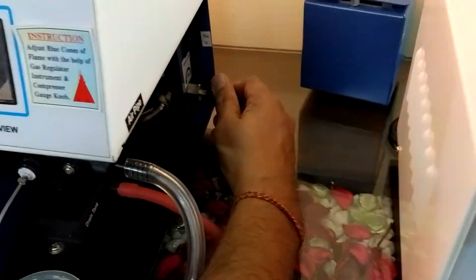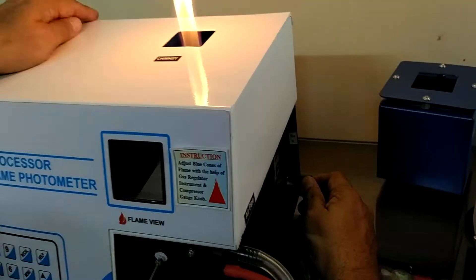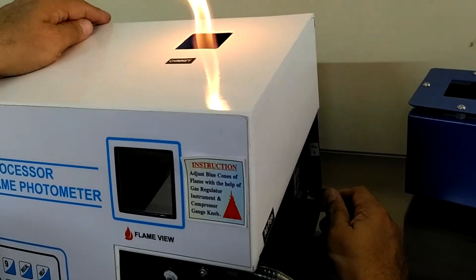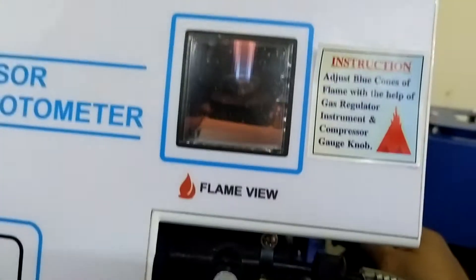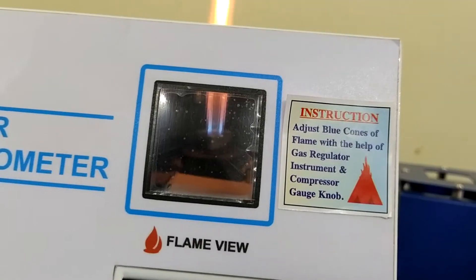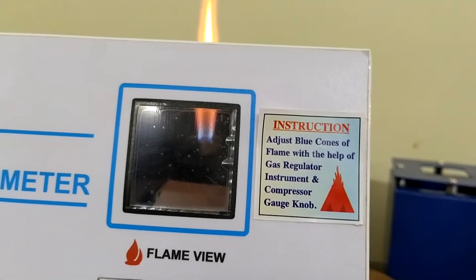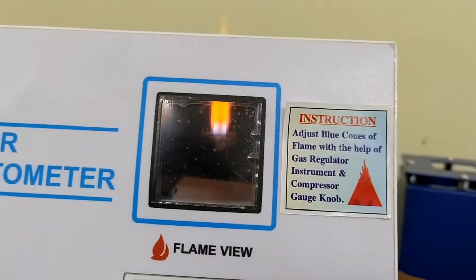Now we have to adjust the flame for Unit 1, the flame photometer. Slowly minimize the gas regulator and view the flame from the top of the burner.